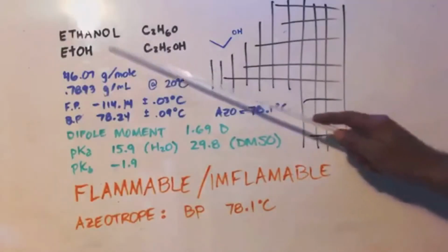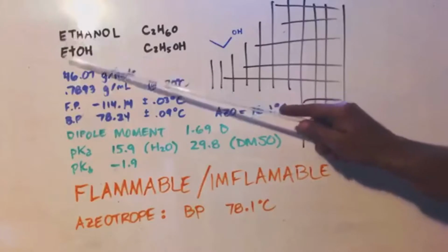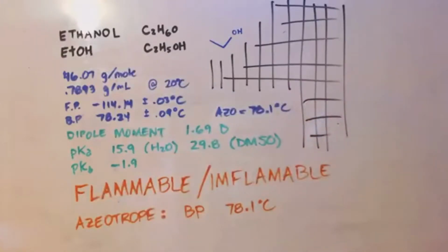Here are the formulas. If you have ethanol, C2H5OH, if you have methanol, you put MeOH. The OH is for the alcohol. Some facts about it: boiling point, dipole moment. I think that D stands for Debye. I didn't look up what the units were. I'm guessing it's Debyes. Keep in mind, this is flammable, like pretty much everything you distill.